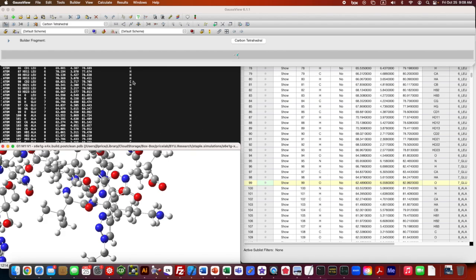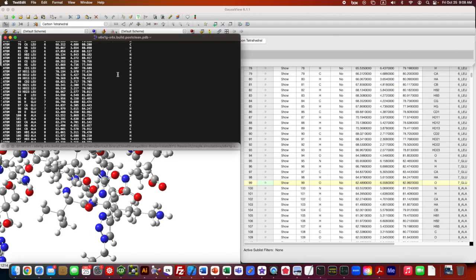So what we'll do is come to the text file. You'll open up the PDB in the text file, and sometimes I like to just return a line so I can keep track where everything is, and I'll delete it later. But the first thing I'm going to do is just type in the new residue name, which for the stapled molecule, the propargyl glycine residue in the stapled molecule is PRB.